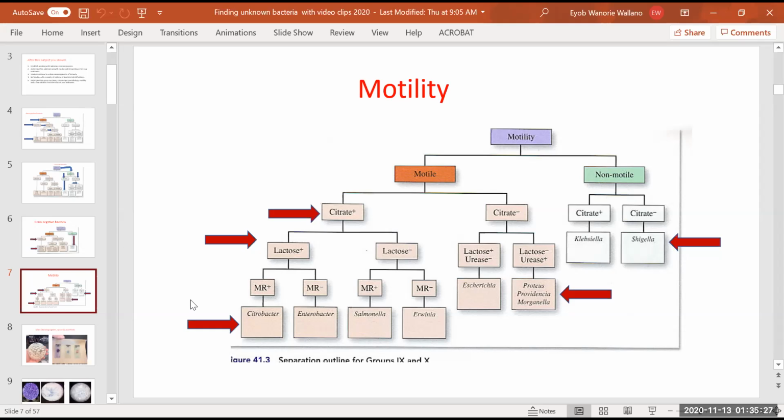So in gram, we focused already. On motility, we focused already. After that, we are going to do the fermentation process. Okay, now, look here. Because of the gram stain, spore stain, and acid-fast stain, we know something. What are you going to know? In gram stain, we separate gram positive and gram negative, then spore forming and non-spore forming, and when we come to acid-fast, we say acid-fast and non-acid-fast. Generally, acid-fast bacteria are gram positive bacteria. You know it. In the past, we were using it like that.